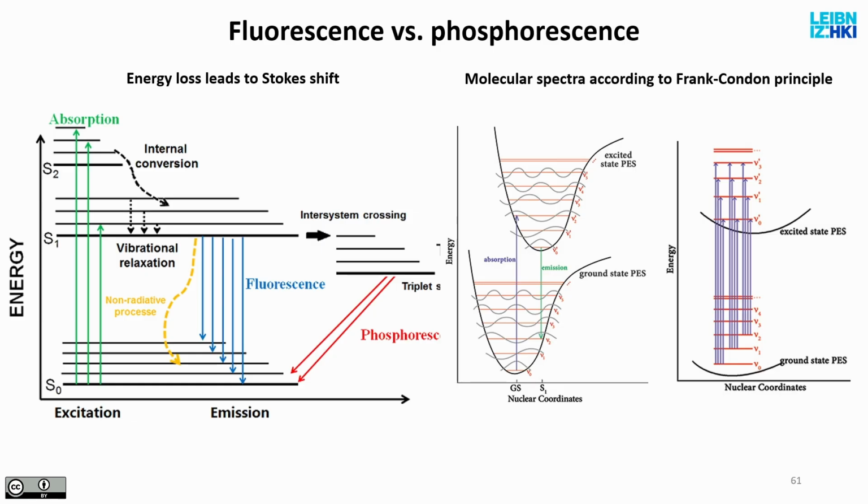So you illuminate the molecule, the light arrives at the molecule, and then it's gone. What happened to it? It got absorbed by the molecule because the molecule had an energy transition that was able to match the energy of the photon.